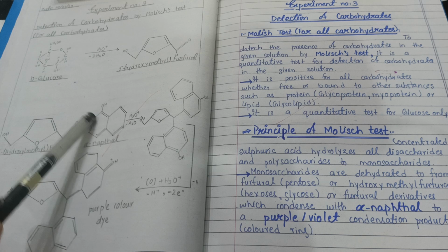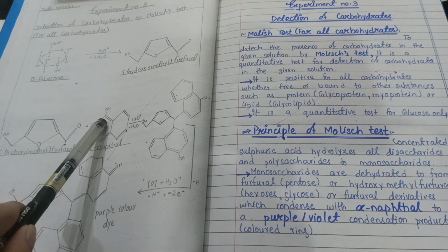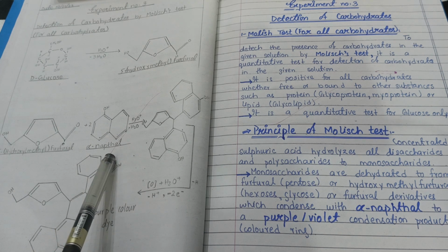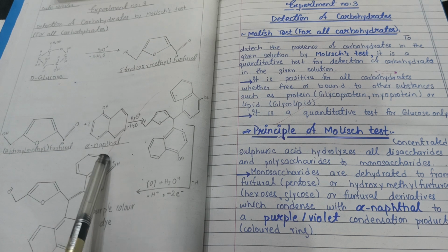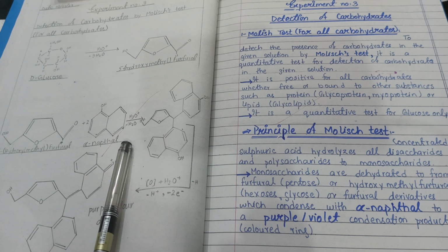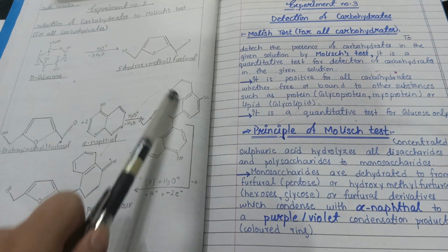So whenever you add an OH on one benzene ring, it forms alpha-naphthol. Now you add 5-hydroxymethyl furfural plus 2 molecules of alpha-naphthol. Again dehydration is going to take place and a complex molecule is going to form.